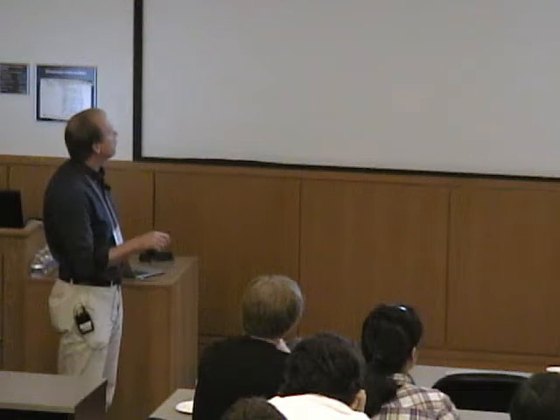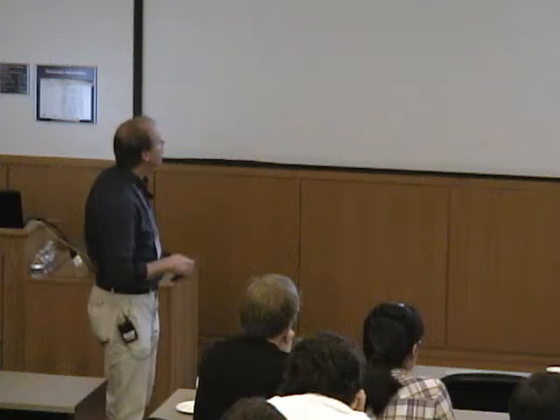So just to give you an example of how this can be done in a real situation, this is some work I was involved in a long time ago where we were measuring these two iron-sulfur clusters in photosystem 1. So there are these two clusters, Fa and Fb, and if you shine light on this or if you add a reductant, you can reduce these iron-sulfur clusters.